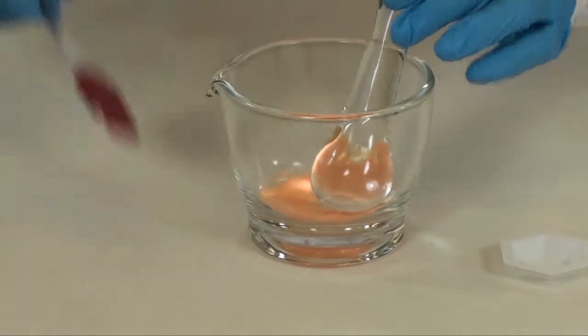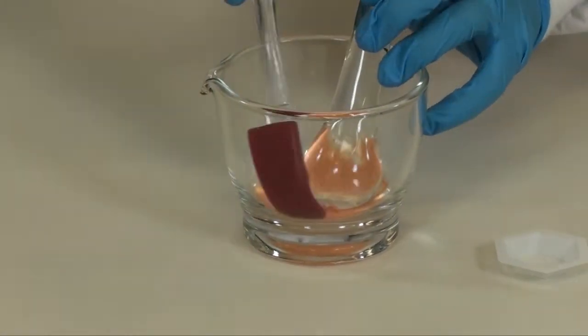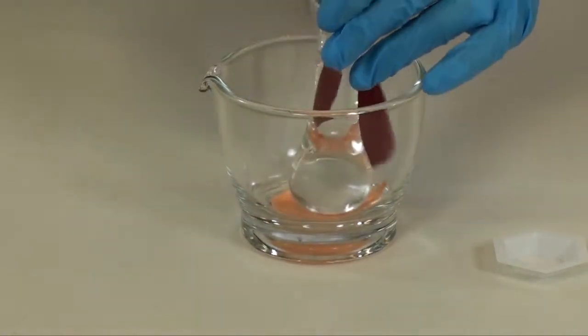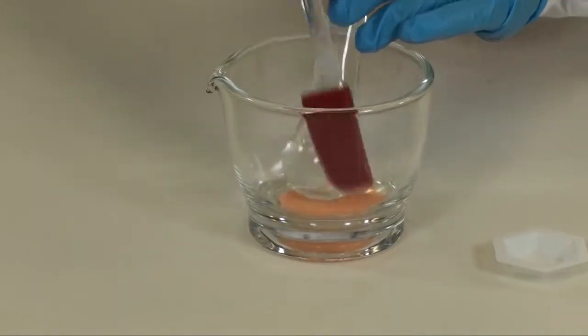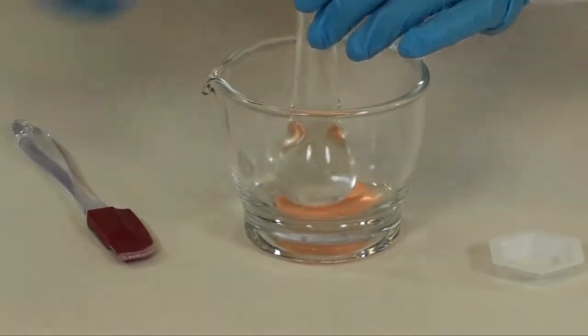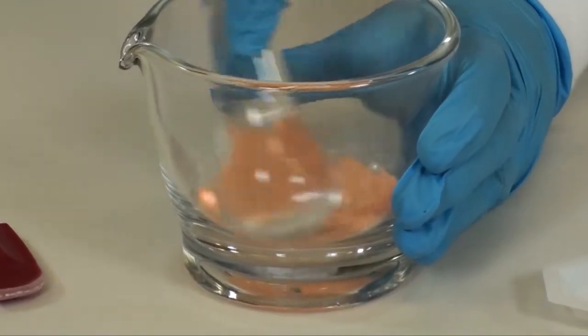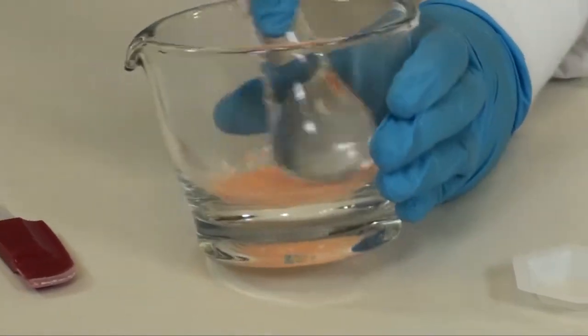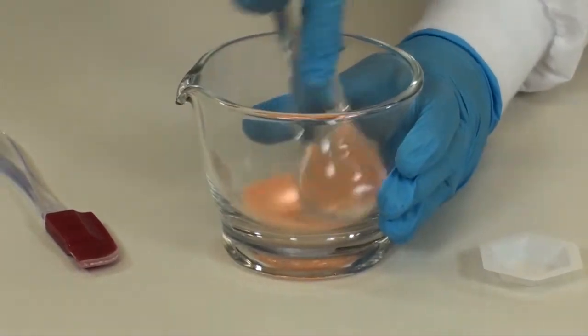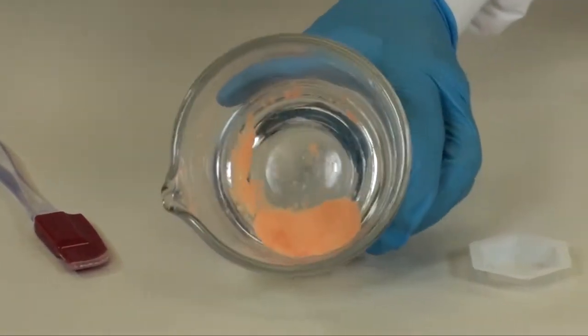You still need to triturate to a fine powder. If you need to scrape the powder down from the sides of the mortar, use your plastic spatula to move the powder back to the center of the mortar. After vigorous trituration, you will have a very fine powder.